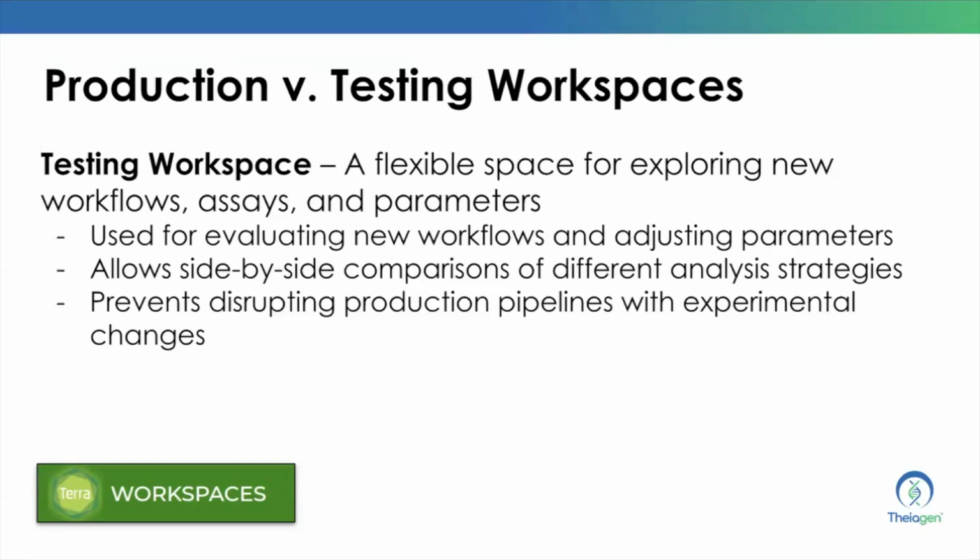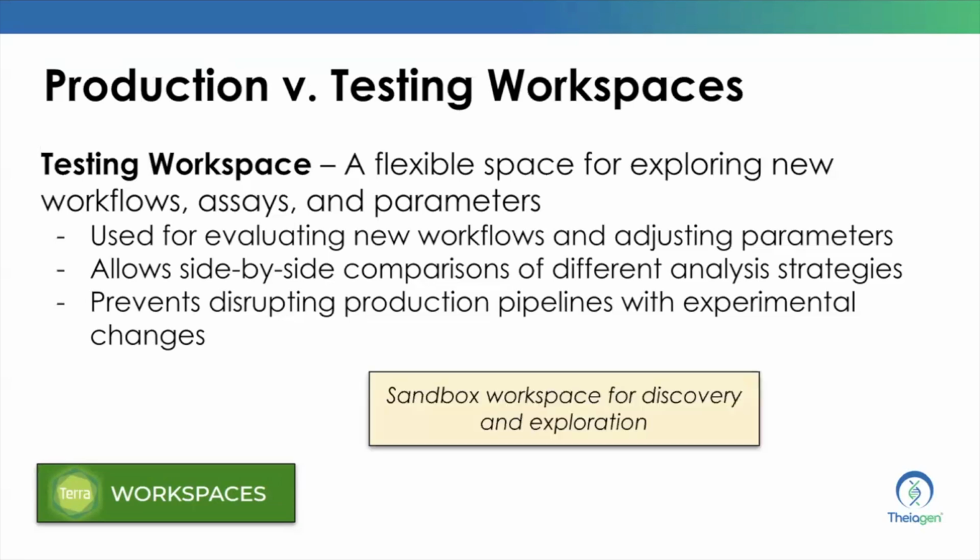For this, you could even duplicate data tables in a testing workspace, one for each set of configurations, and use our Thea Validate workflow to assess the impact on analytical results. Doing this type of work in a testing workspace prevents disrupting production pipelines with experimental changes. And so, as a rule of thumb, a testing workspace is a sandbox for discovery and methods development.